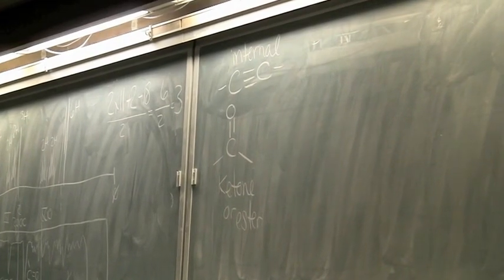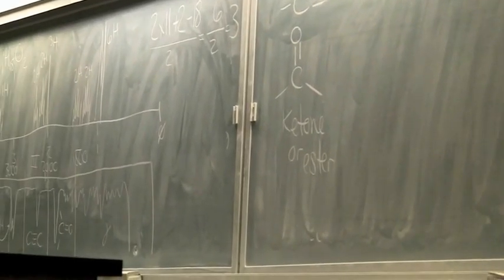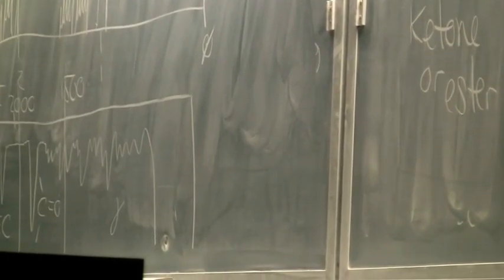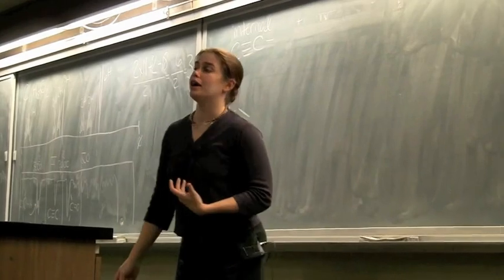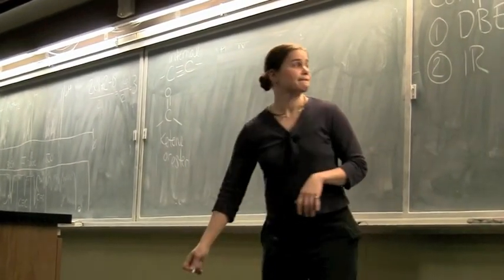And we keep going in that IR, and we just see fingerprint. There's Cs in there. There's probably other oxygen bonds. We've got at least one more oxygen, probably a carbon-oxygen single bond somewhere. Fingerprint, don't worry too much about it. It's not easy to interpret. So those are what we got: internal alkyne and a ketone or ester from our IR.